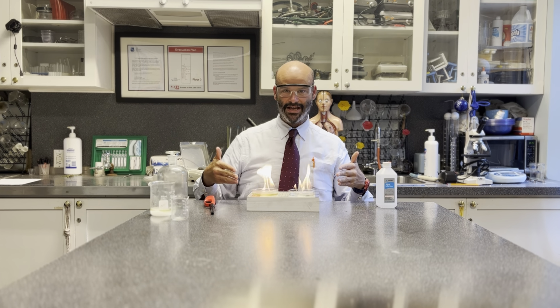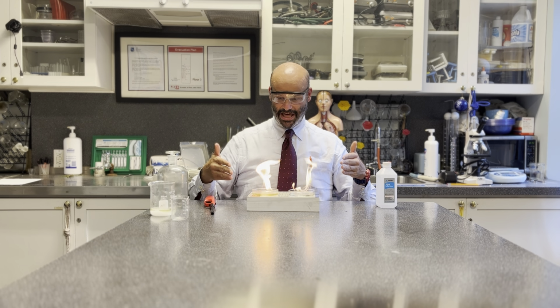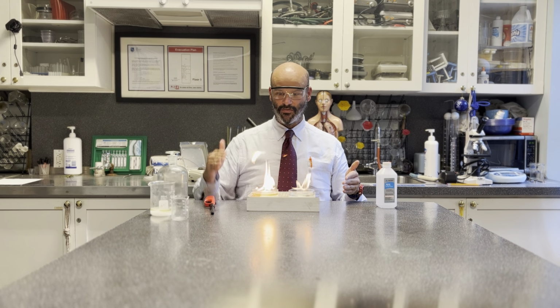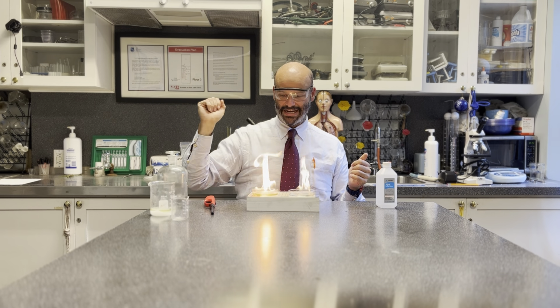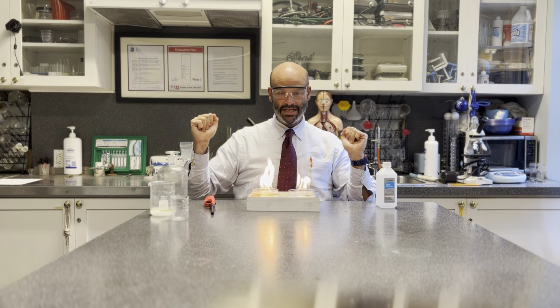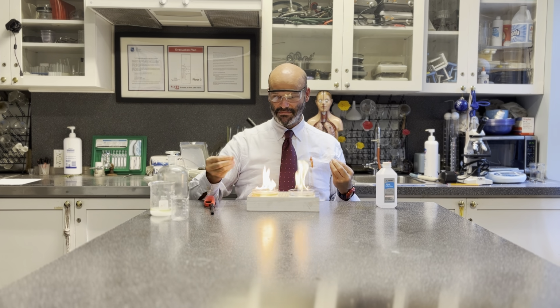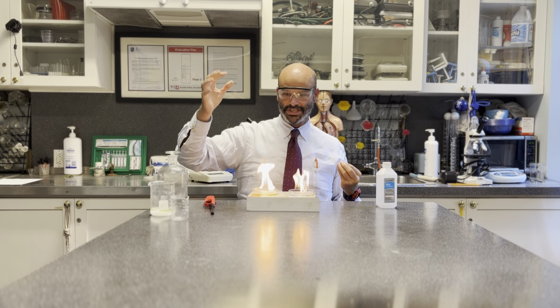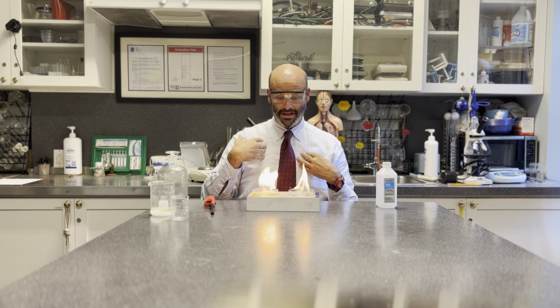All right, let's take a real serious look at what we've got here. You can see a difference in the fire. We can see that the flame is getting significantly higher at the 95% alcohol, much lower at the 70% alcohol. We also see differences in the color. This is a much brighter orange. There also seems to be more smoke coming off, or at least from my end, from here.